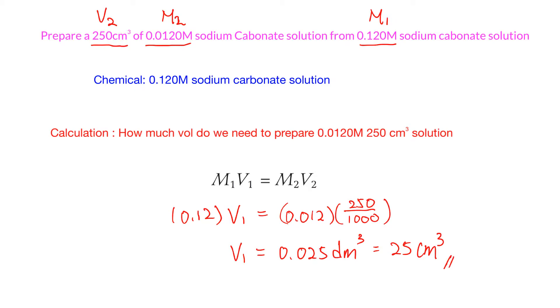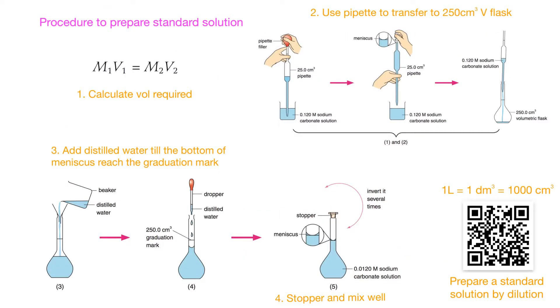So this is the very first step - we have to know how much stock solution is required to prepare the standard solution that we want. After we do the calculations, we know the volume required. Then we'll use a pipette, which can transfer a specific volume accurately. We transfer 25 cm³ of the solution and put it directly into the volumetric flask.